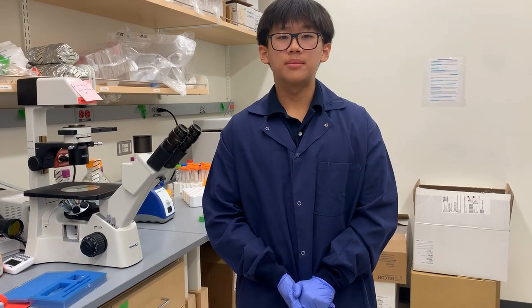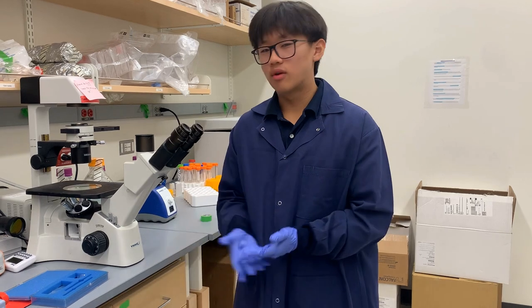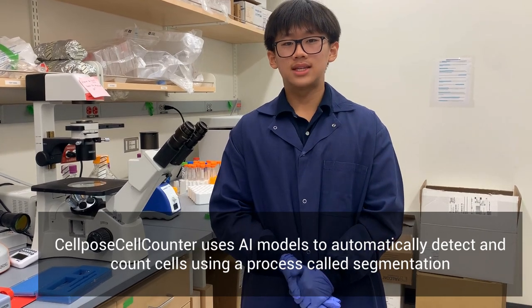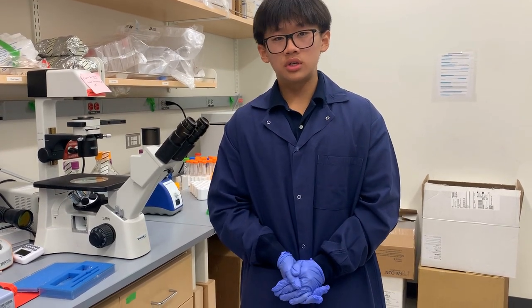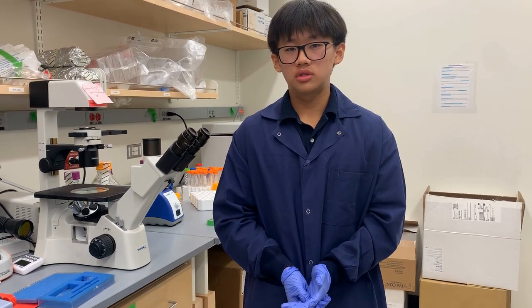For the Congressional App Challenge, I created CellposeCellCounter, an app, as you might have guessed, for biologists. And so what CellposeCellCounter does is that it uses AI models to automatically detect and count cells using a process called segmentation. Built on the CellposeSAM architecture, it helps researchers obtain crucial measurements that normally would take hours, reduced to mere seconds.